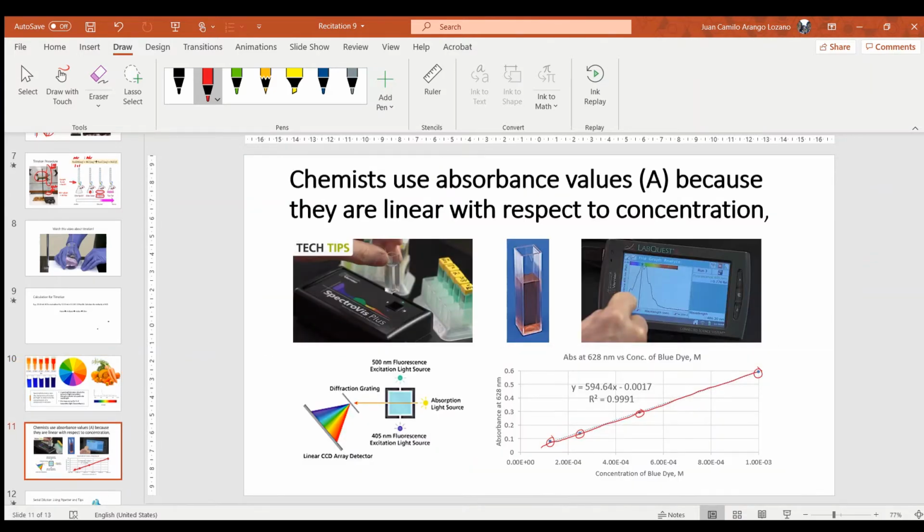If we move forward, this is the basic setup you should have in the experiment if you were to run it, and this is the spectrophotometer. This is the cuvette where you load your analyte, and inside this little hole over here, you will irradiate that sample with visible light within one specific range of wavelengths.